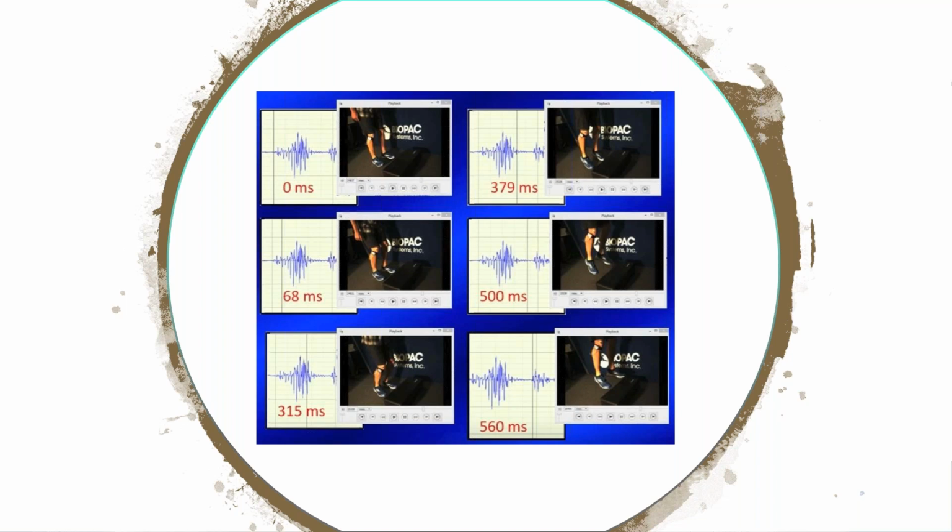I don't think it will work well for a webinar, but it shows someone jumping from the floor onto a step stand, and then looking at the frame by frame transitions, you can see precisely the point of takeoff, you can see the point of landing, you can see the person as they're traveling through the air to the point where they land on the step, and vice versa when they jump back down the other way. So the high frame rate camera is really designed for applications like this, where you need to have really good resolution of what the person is actually doing.